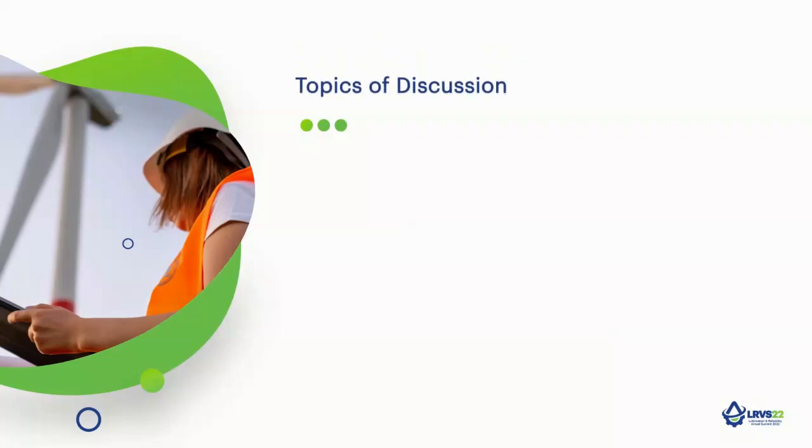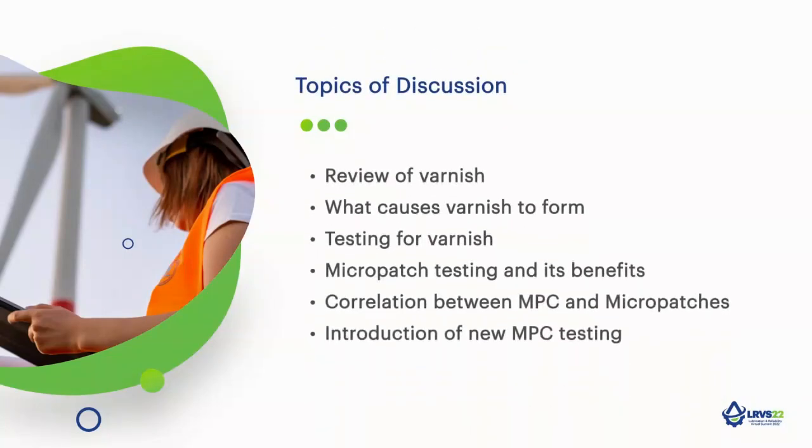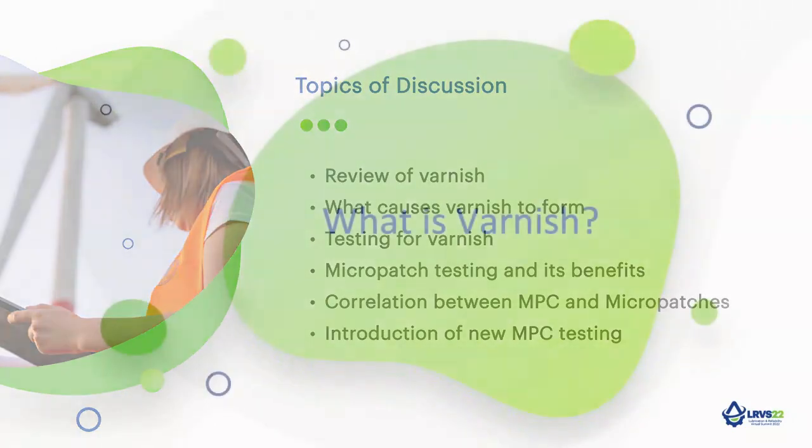What we're going to be reviewing today is a quick review of varnish, what causes varnish to form, testing for varnish, micropatch analysis and its benefits, as well as correlation between MPC analysis and micropatch, and then the new introduction of our new MPC testing.